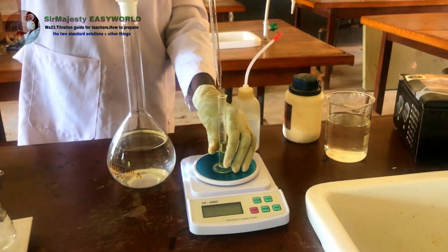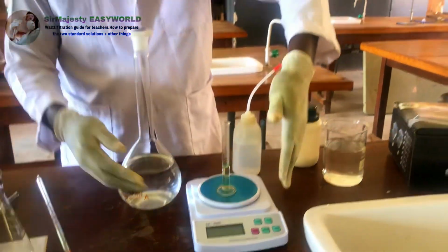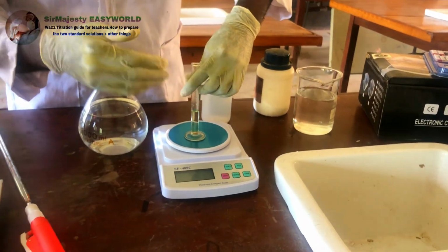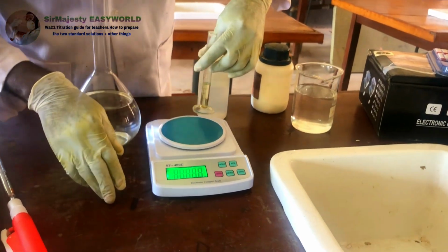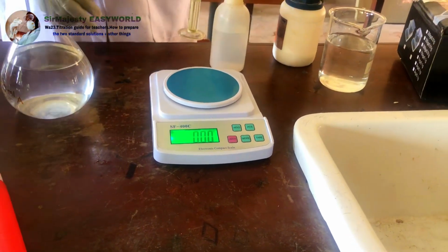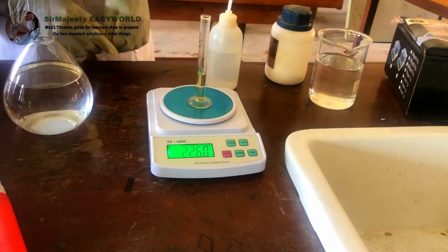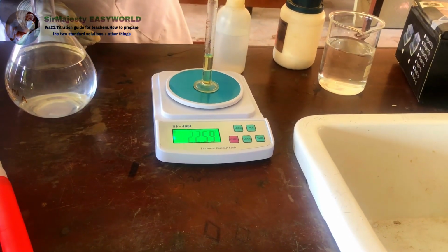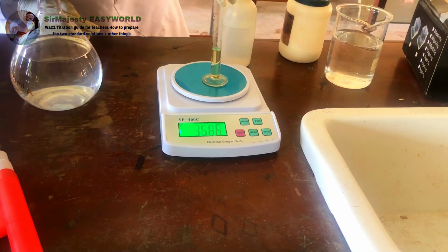Do it safely. Make sure no drop falls, for accuracy. Okay, now it's obvious the digital balance is off. What we will do is lift this before you put it on, because if you stay on it, it may not reset to 0. Okay, I think it's showing 0 there. We already know the mass of this alone, so let us know the mass with 5 mil. Okay, there is a little discrepancy. Okay, no discrepancy, still 5 there.